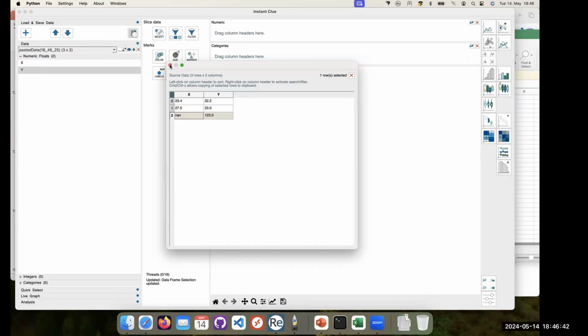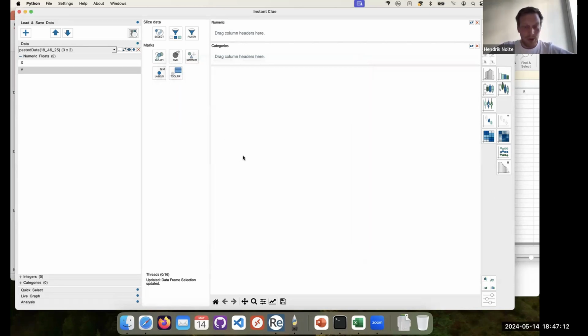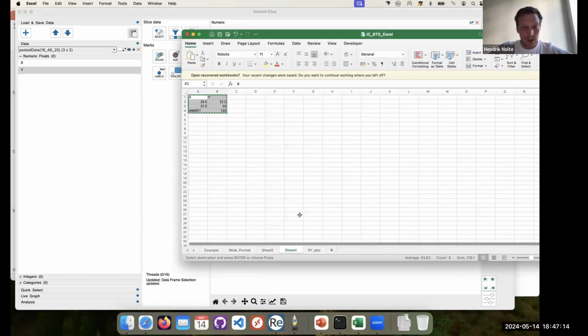And I also have a question for that. Can I actually just use a regular expression, because it seems that Excel always uses hashtag some word exclamation mark? Sadly not in the official version. In our development version, yes, and I will hopefully change that you can write any regular expression and then consider this. Yeah. Okay, thanks. A good point. I will write it down and then change it and add it in the GitHub page once it's available. Okay, cool.